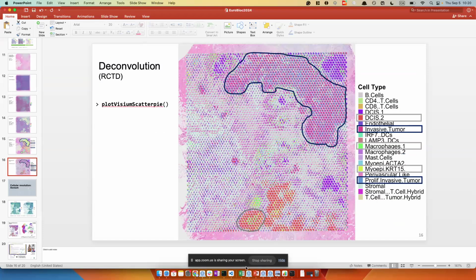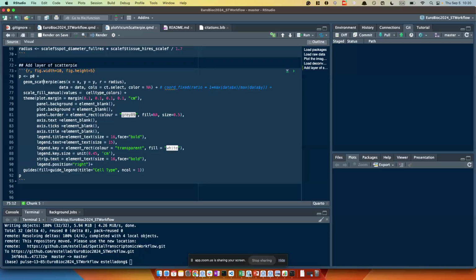So I think I will make it flexible so that the user can choose what kind of format they want. I think what I just showed you is more straightforward, so you don't need to think about these objects, but I'll also make it possible to integrate with the class.